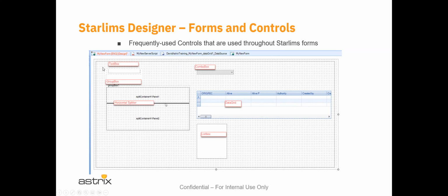Here's a combo box. It'll appear with the downward facing caret chevron. These have multiple properties allowing, for example, editing the actual value that appears, or a read-only mode which allows the user to select only the values which appear in that control. These controls are typically populated with a data source. So one of the options in the control itself, and we'll visit that shortly, is to populate the control from a data source.